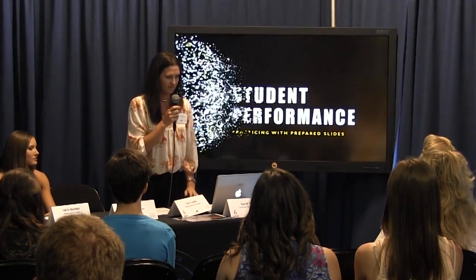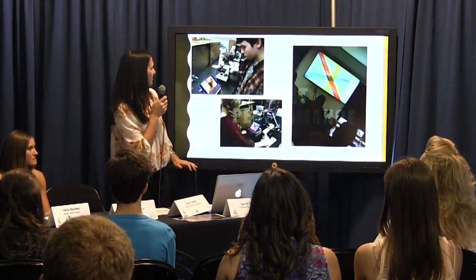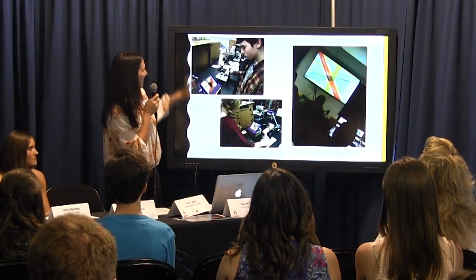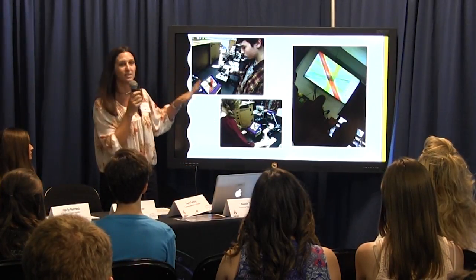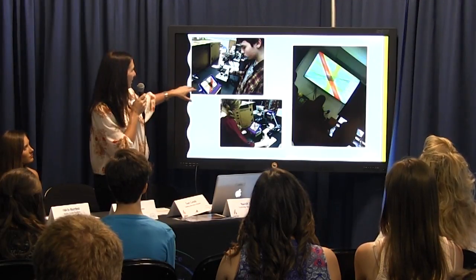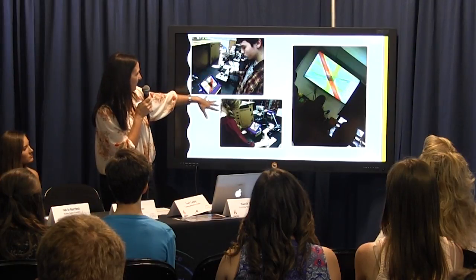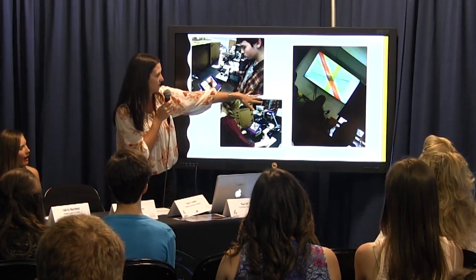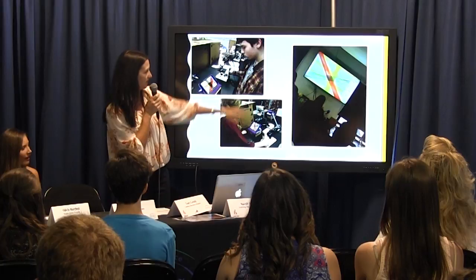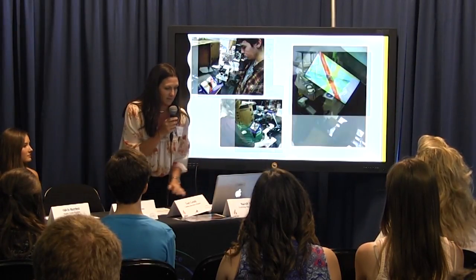Okay. All right, so this was just prepared slides. I just captured some images of what we did with it. I've got a lot of stuff going on here, but we started out with just threads, the letter E, the basic stuff. So this was a student using it, and I was talking them through it. I let some students be the presenters, and so they got to use the teacher one as well. So that was just some slides of that.